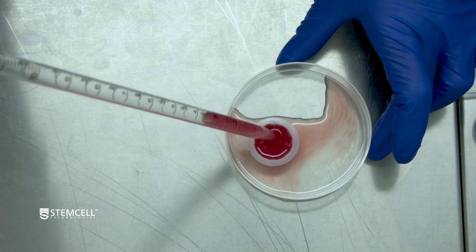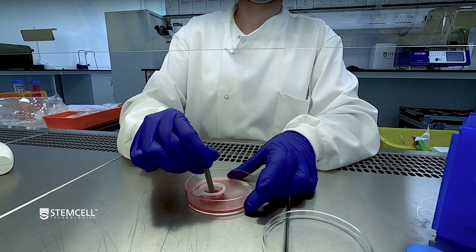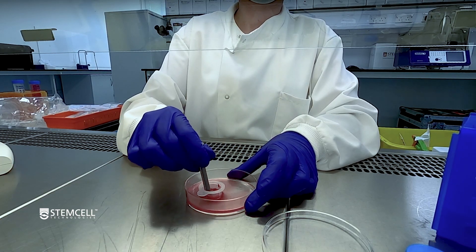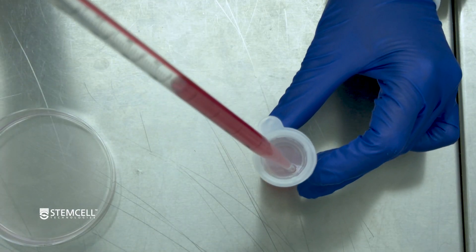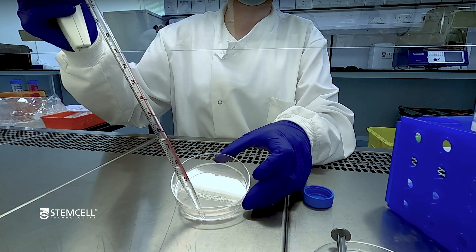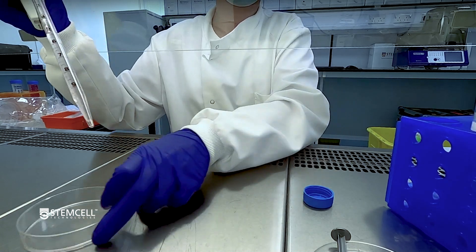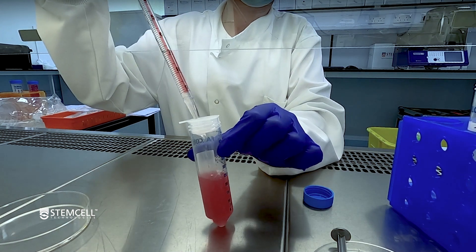Transfer the digested lung tissue into the strainer. Push the tissue through the strainer with the rubber end of a syringe plunger to dissociate the tissue. Pass the cell suspension through the strainer. Rinse the dish and strainer with additional PBS containing 2% FBS and then pass it through the strainer on the 50 ml tube.